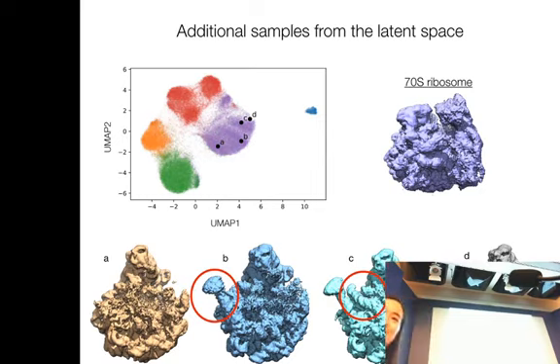If I understood correctly, you need to choose the dimensionality of Z before you apply it. Correct. Is there guidance on how to choose that, and how does it change for different dimensionalities? Yeah, so in all the examples that I've shown here, other than that first synthetic example with the one-dimensional motion, they're all trained with 10-dimensional latent variables, and that's just a hyperparameter that you have to select in your architecture before you train. You could cross-validate the latent dimension, but so far I haven't done that, and what we've seen is that as long as the dimensionality of your latent variable exceeds the dimensionality of the heterogeneity you're trying to model, you're okay so far. But that's definitely something that could be tuned.